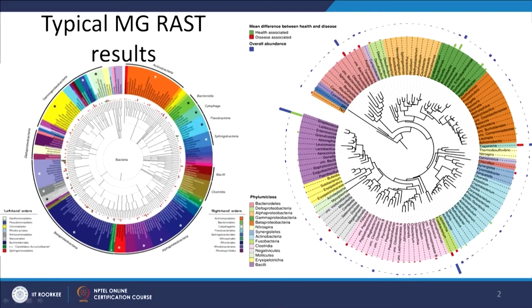In previous examples I showed you per sample analysis of the metagenome that you have uploaded on MG-RAST. Here let's take a look at how we can use the data from MG-RAST to make comparative analyses between different samples. On the left panel, we have this particular dendrogram from one sample, and this is from MG-RAST, by the way. You'll notice that MG-RAST can give you information at class level, phylum level, family level, or species level. You decide the level of resolution that you want your data to be represented.